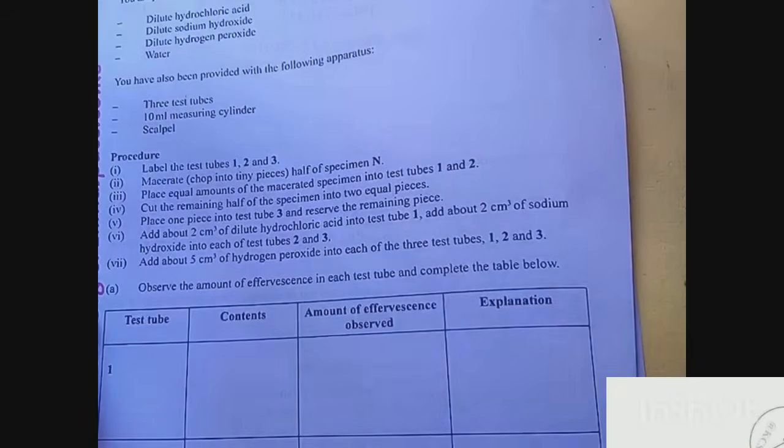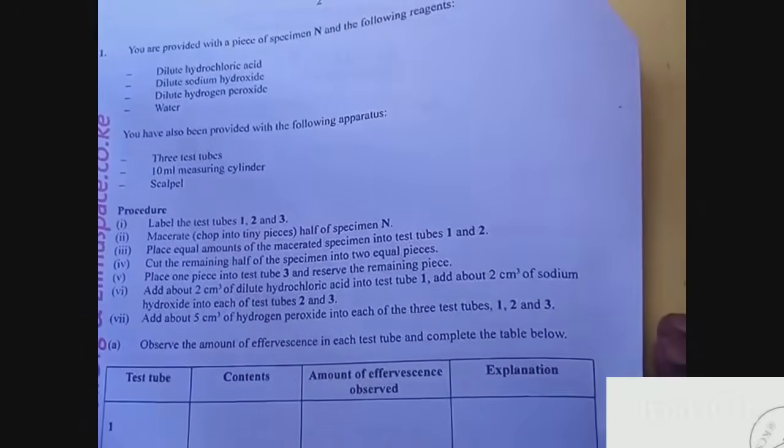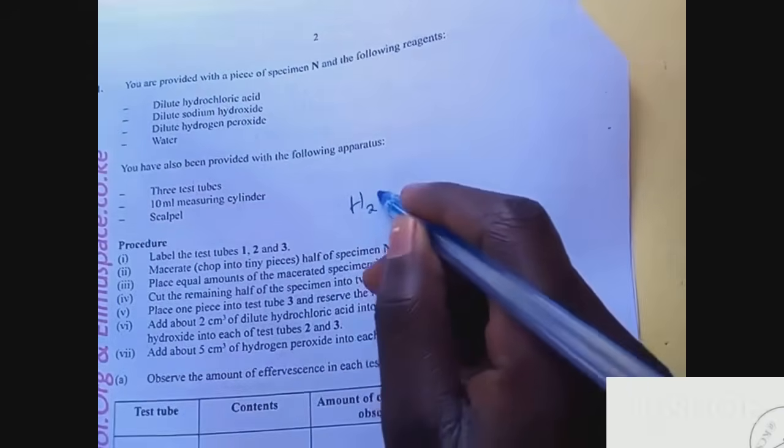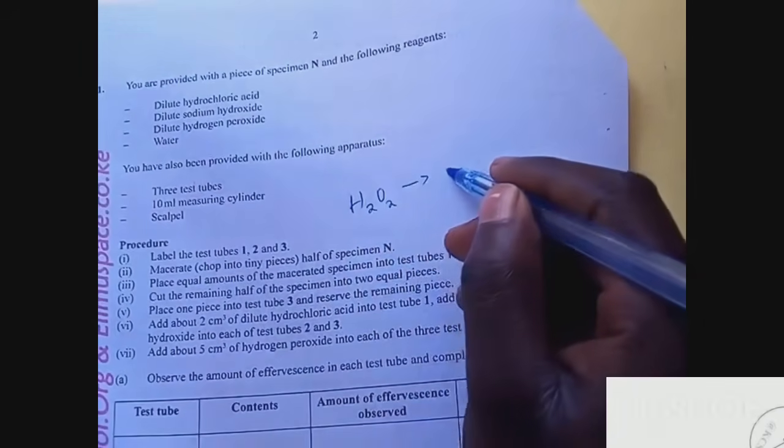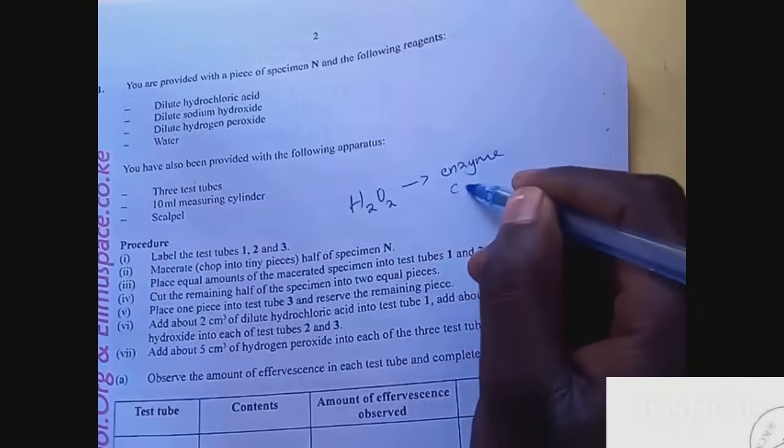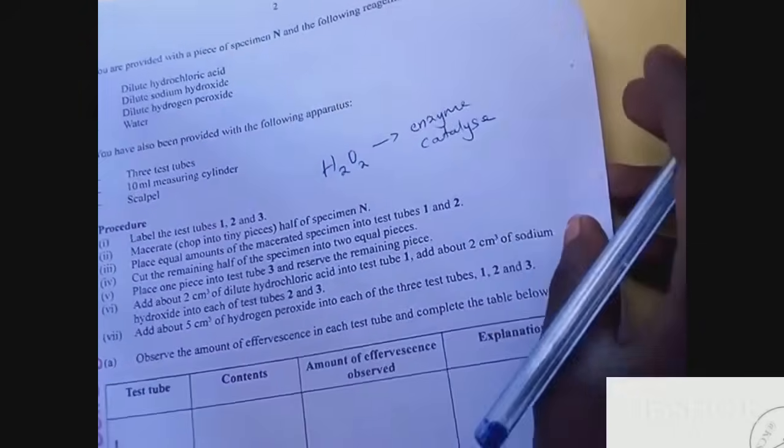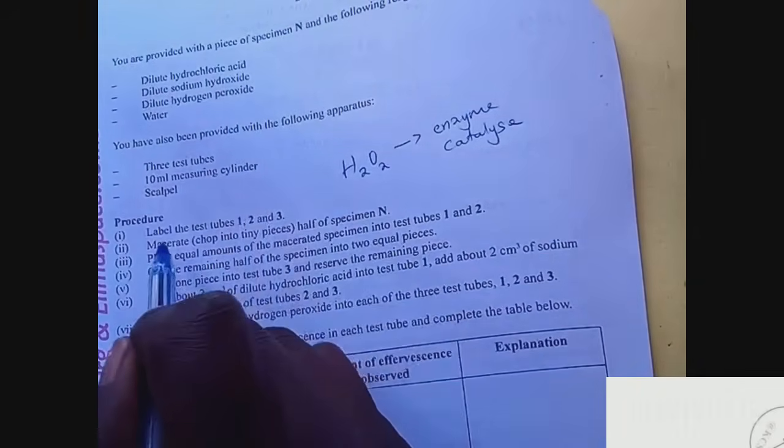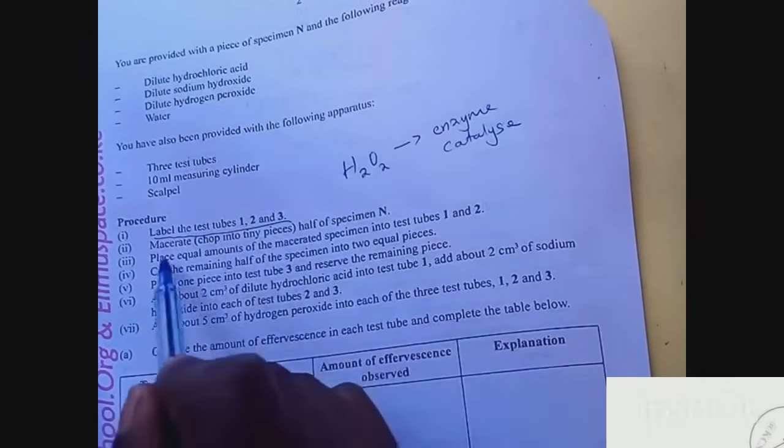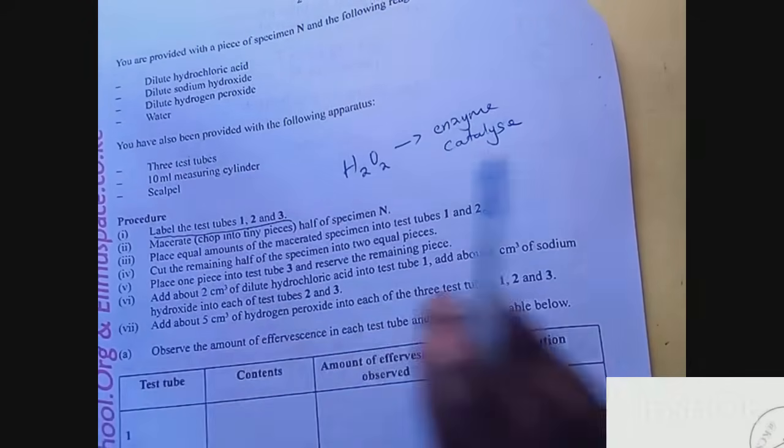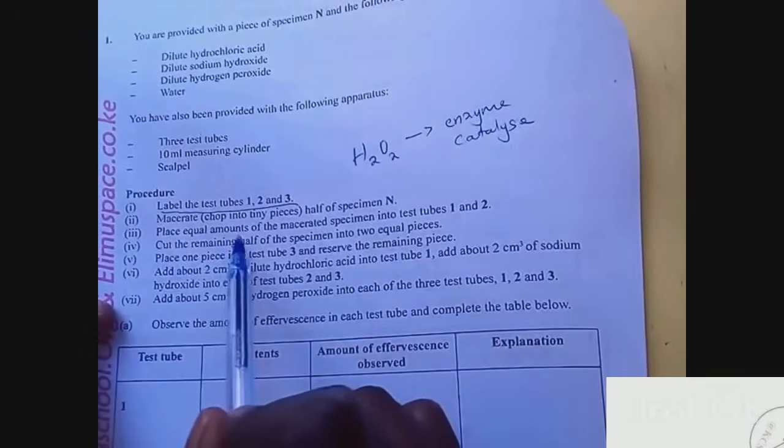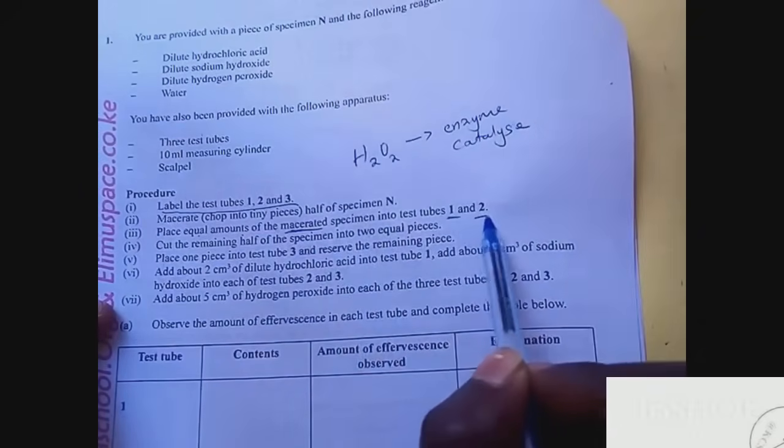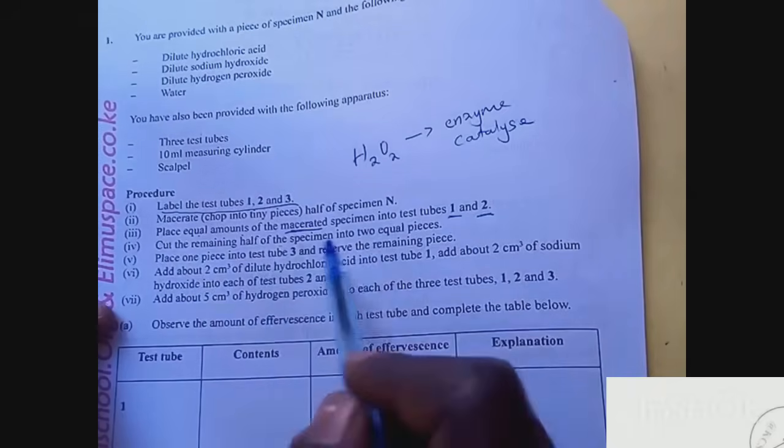Observe the amount of effervescence in each test tube and complete the table. First of all, students should be able to know what is being tested. When you see hydrogen peroxide, you automatically know that you're testing for enzyme catalyst. Let's start the procedure again. You are provided with these reagents. Label the test tubes. Macerate is to cut into small pieces. Place equal amounts of specimen into test tubes one and two, then cut the remaining half into two equal parts.